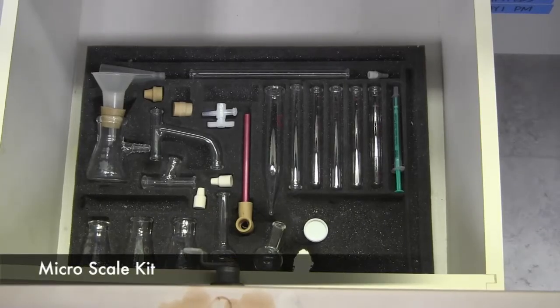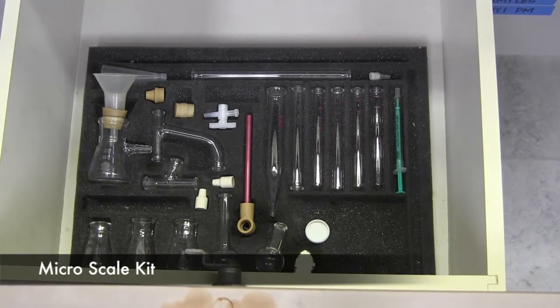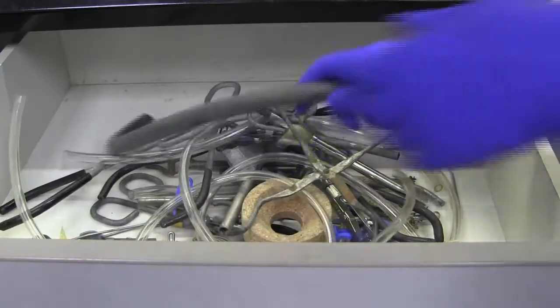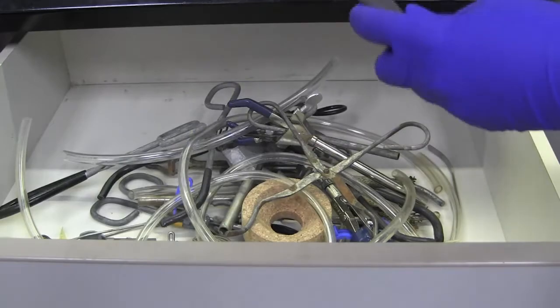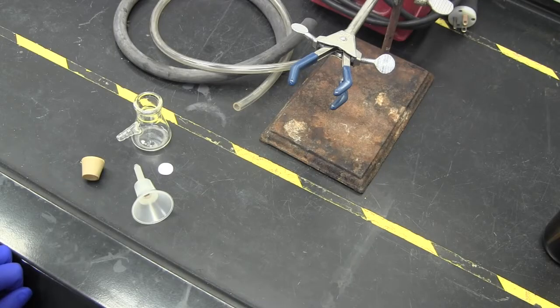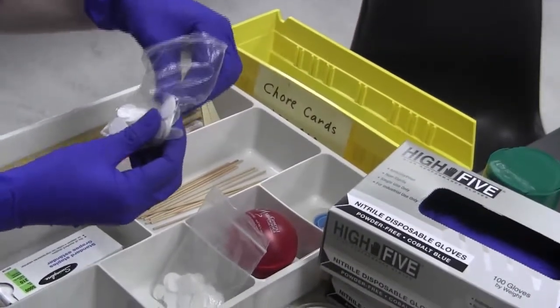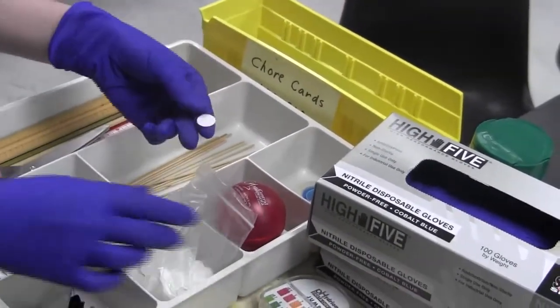Now we will learn how to set up a Hirsch apparatus. The pieces can be found in the drawer with the micro scale kit. You will need a thick black or red rubber tube, a glass filter flask, and a Hirsch funnel with a rubber connector. You will also need a piece of filter paper, which can be found on the cart of supplies in the lab. Otherwise, you can ask your TA for one.